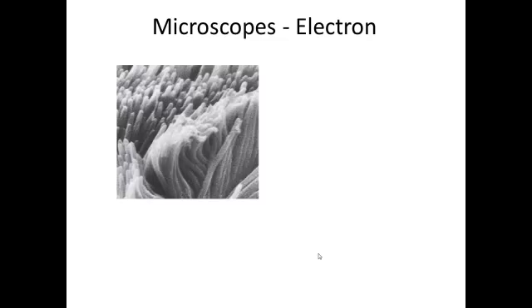This first image was created using a scanning electron microscope, or SEM. Beams of electrons are played over the surface of an object. This allows us to see 3D images of the structures, such as these cilia that cover the surface of a human tracheal or windpipe cell.